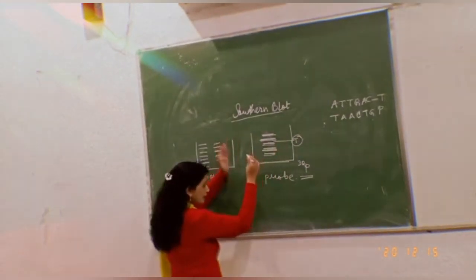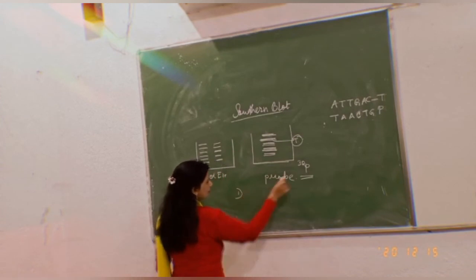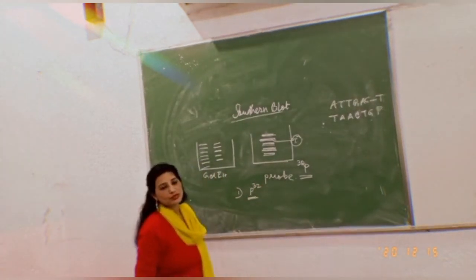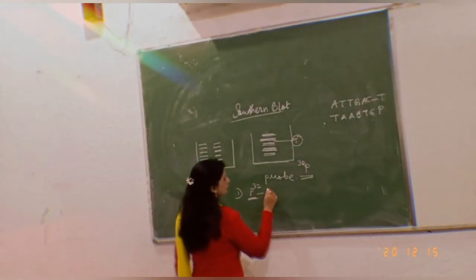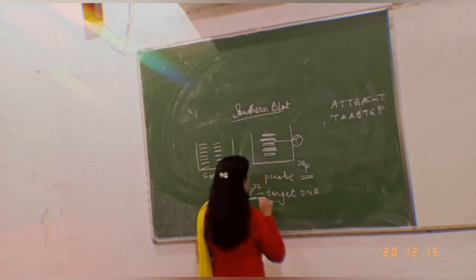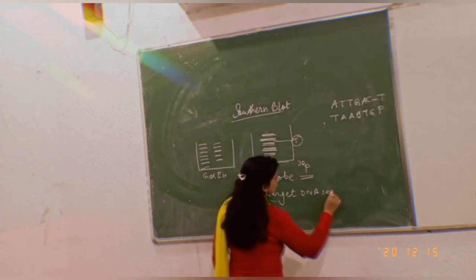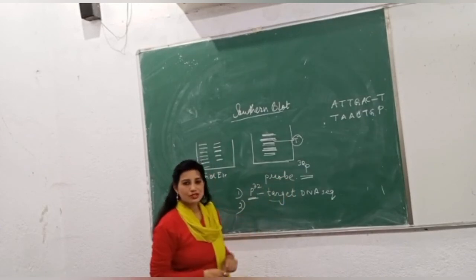And then after that, there are some ways by which one is by the P32. If I am using it, this radioactive isotope can be easily used to locate the particular target DNA sequence. As P32 is also present in the DNA molecule, it will locate it. That is nucleic acid hybridization.